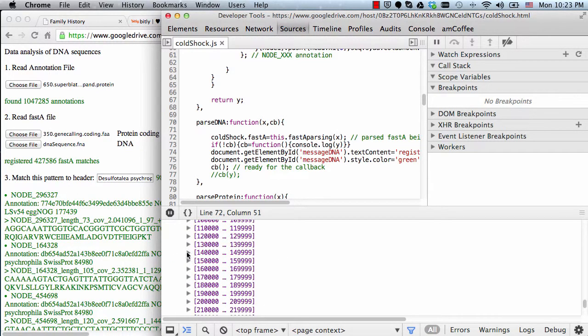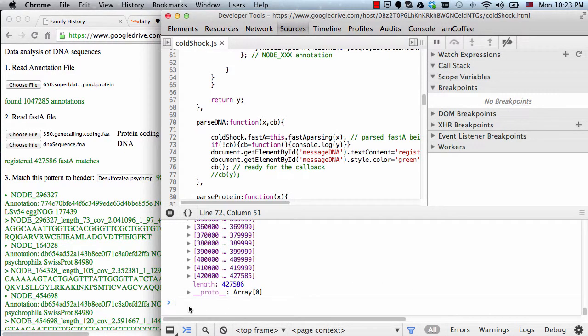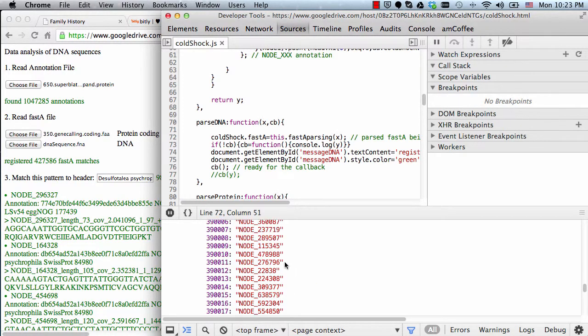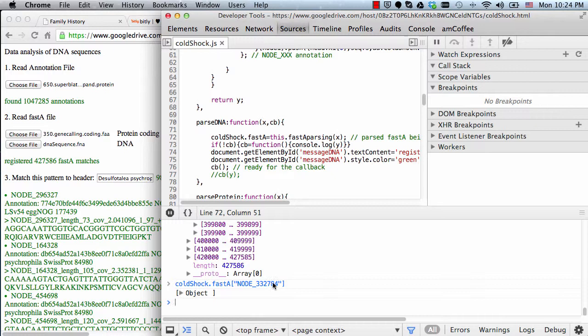Now let's look randomly inside. So these are just the indexes. So I'm going to pick randomly one of them. So this one. And let's go back to the native object, FASTA, and look for this entry. I lost something along the way, sorry about that. Let's do it again. Pick one of these, copy, and paste. Now we have an example of a registration for which there is only one sequence.